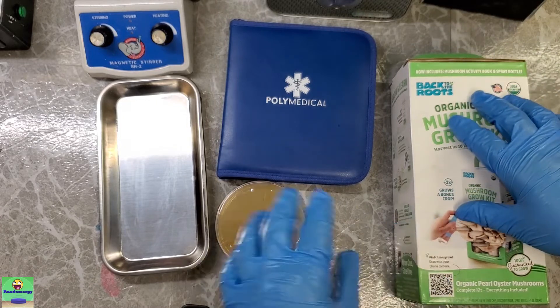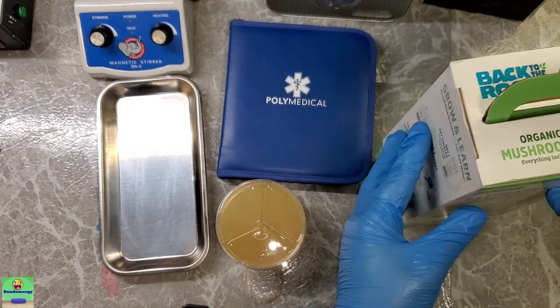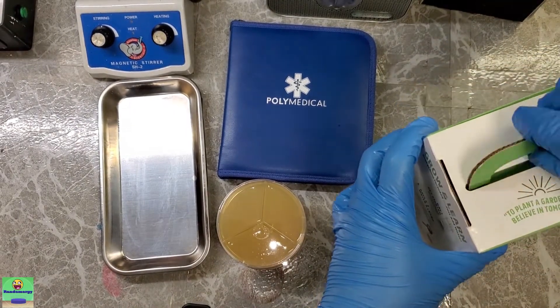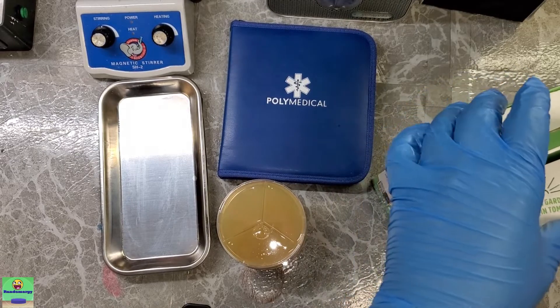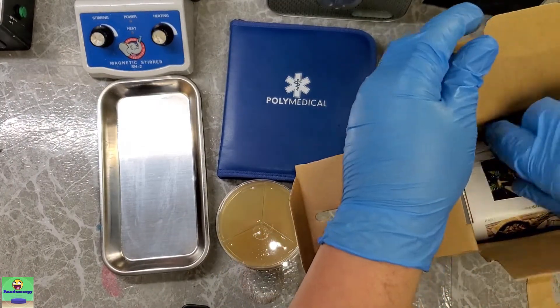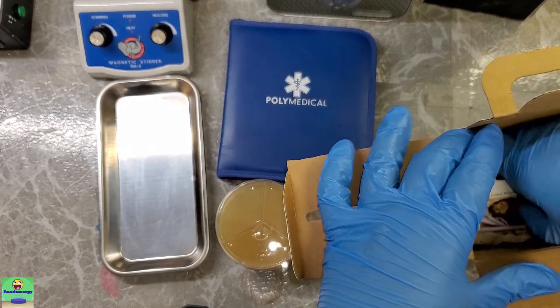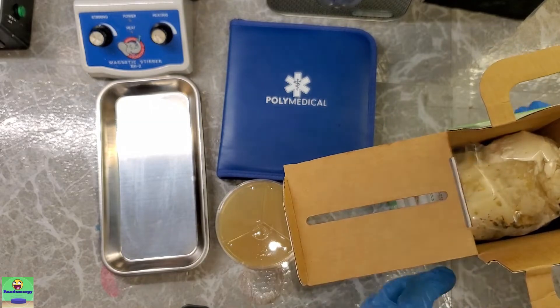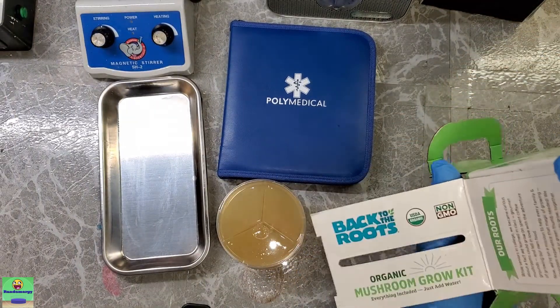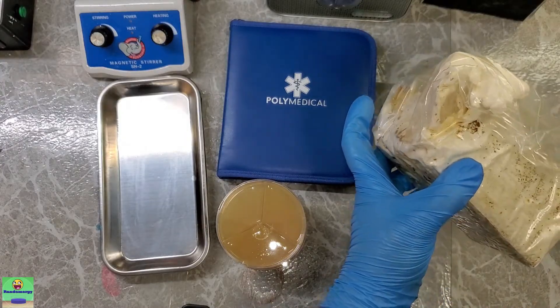I wanted to save it for growing on other substrates so I can propagate my own mushroom bags and not have to keep buying these kits. They're really convenient, but at 20 bucks a piece they're kind of expensive. It's also nice to start with this rather than growing off spores because it'll be so much faster.